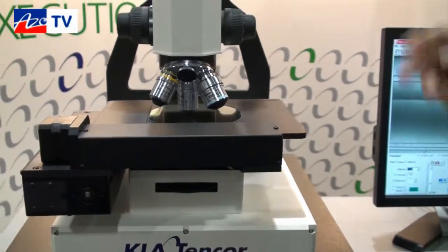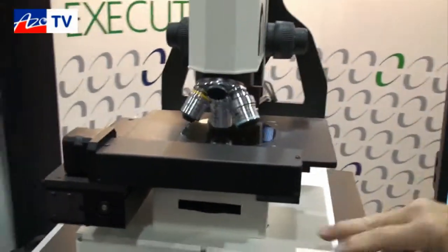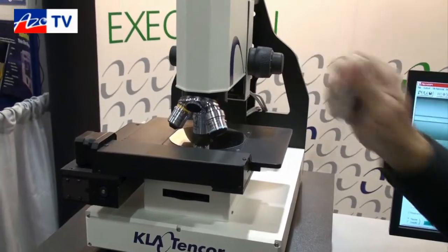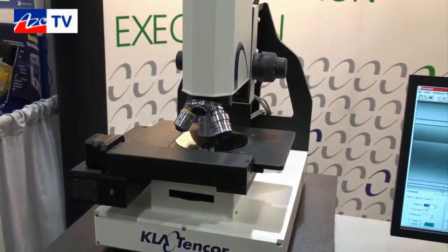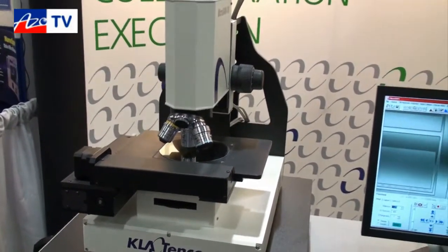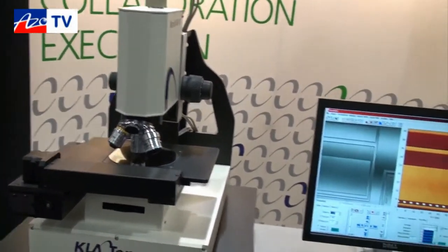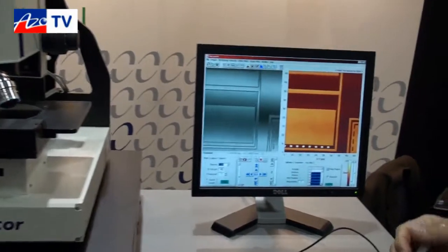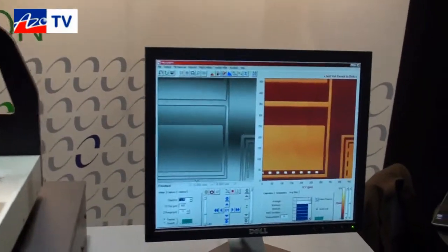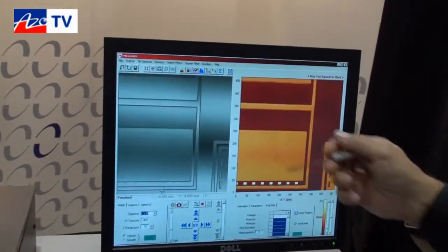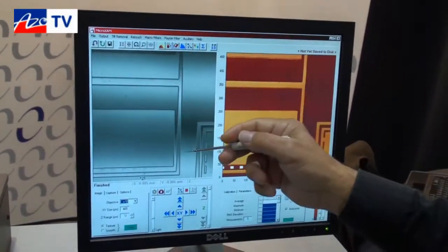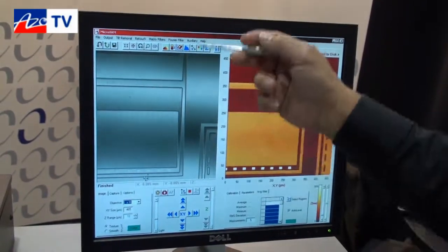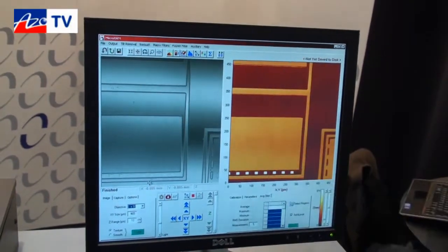This is a manual focus, manual tip-tilt, and a motorized XY stage. We have a very user-friendly interface to operate the tool. Here's our live camera view, and you can see the fringe interference fringes here.